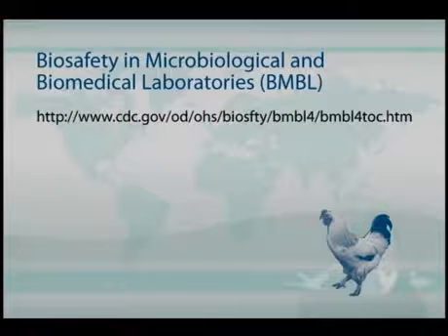There is a 5th edition that has been completed, and it is due to come out sometime in 2006. And this new edition has a completely revised chapter on safe handling of avian influenza virus. So I would encourage you to access this website and certainly keep track of when that new 5th edition does come out. These are the guidelines that you really should follow. I'm just going to provide you some very general overview of what's in that manual.